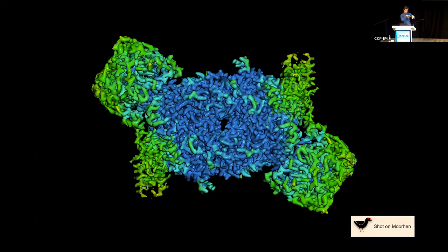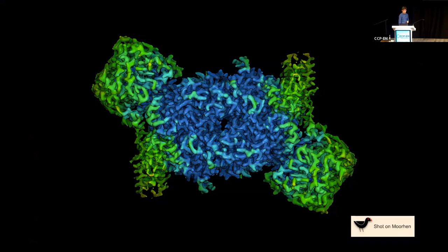It's difficult to tell what's the actual shape of the map. You don't really know what's inside the map, what's outside, and that's because I've turned off ambient occlusion for this picture. But we do have ambient occlusion in Moorhen, so if you turn it on, then it will look like this. So this is the sort of picture that you can take in Moorhen once you turn on ambient occlusion, which is obviously very important for cryo-EM. You have a better idea of how the map actually looks, and the picture becomes much more informative.